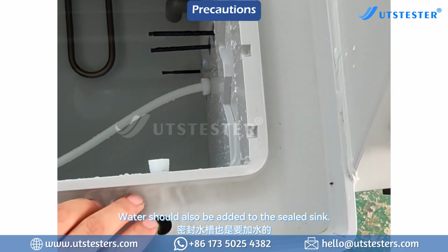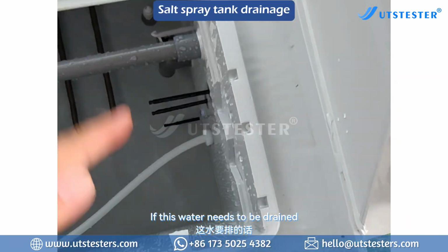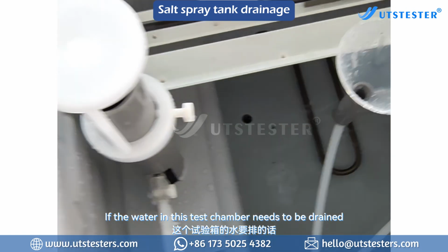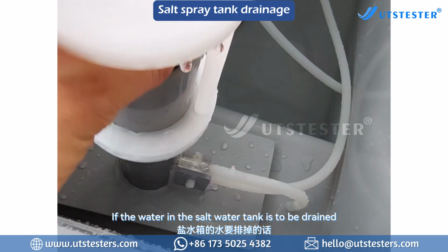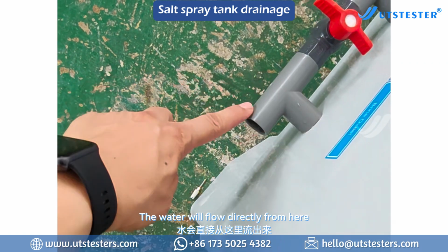Water should also be added to the sealed sink. After adding water, cover and seal. Fog won't come out of here. If this water needs to be drained, just unplug this rubber plug. If the water in this test chamber needs to be drained, just open this valve. If the water in the saltwater tank is to be drained, just unplug the rubber plug inside. The water will flow directly from here.